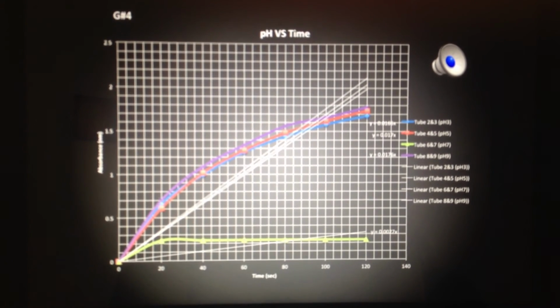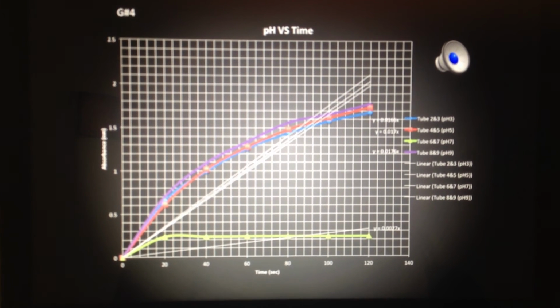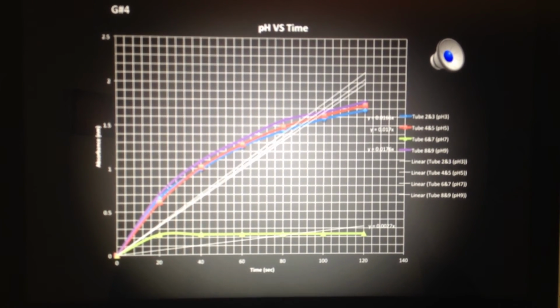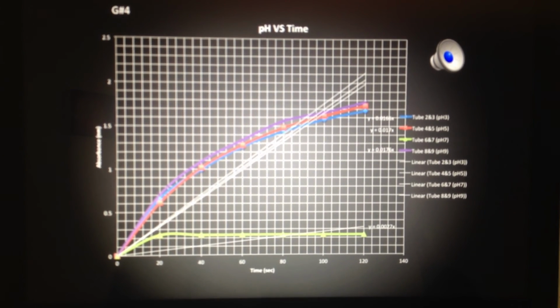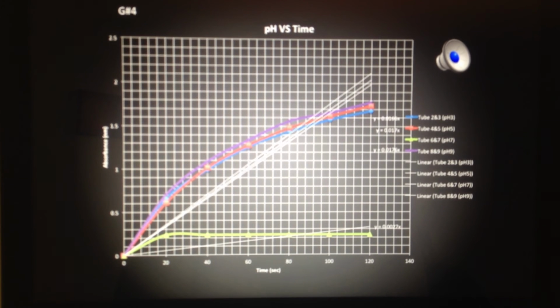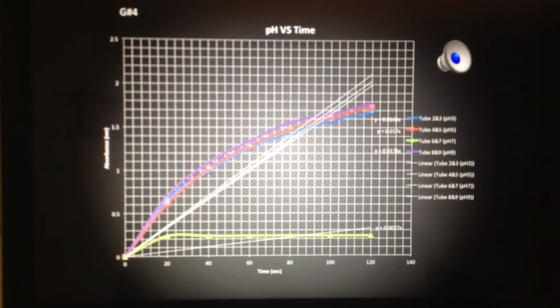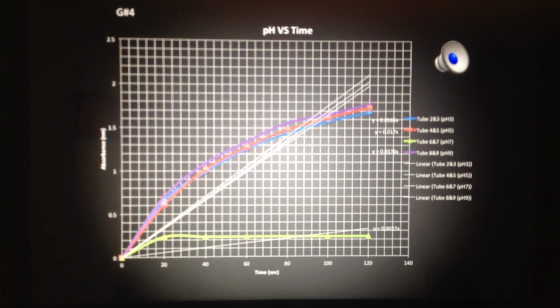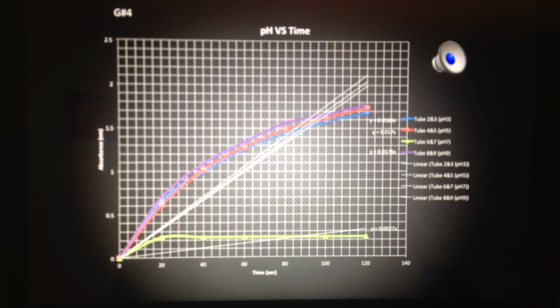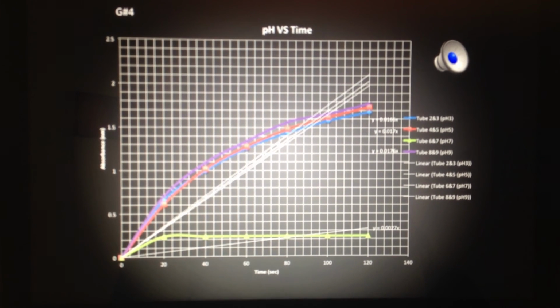As the pH level gets higher, the enzyme's activity also gets higher. This graph shows that at a pH level of 9, the enzymes were working very well, compared to a pH of 7, which shows that there was only a little activity. At pH levels of 5 and 3, the enzyme was suitable to work. The pH that is optimal is a pH of 9.